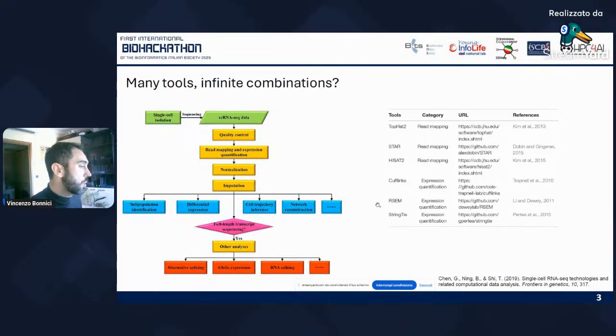Okay, so usually you know the state of the art of the computational pipeline, and you always have to understand what these tools are doing, what the limitations of these tools are, and whether you can optionally or hopefully combine the outputs of two or three of these tools in order to obtain your desired data.